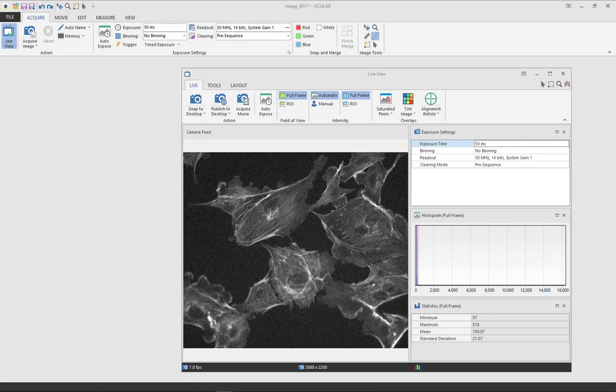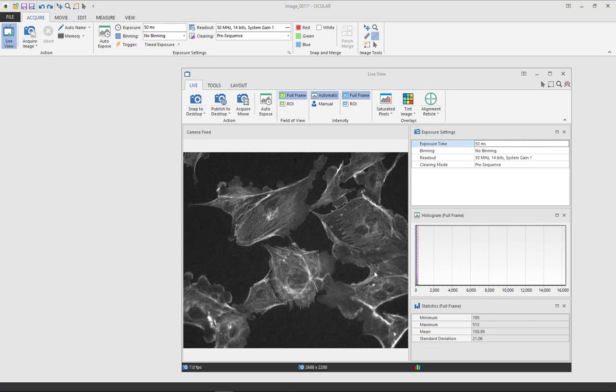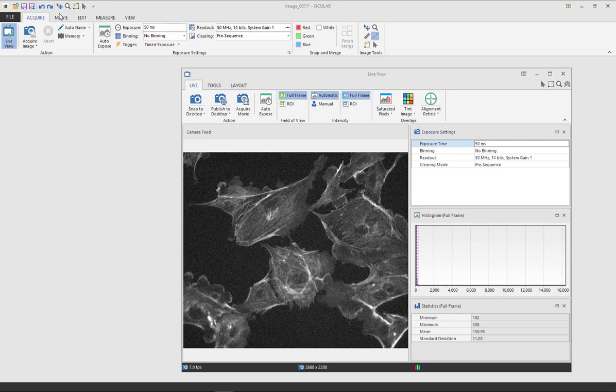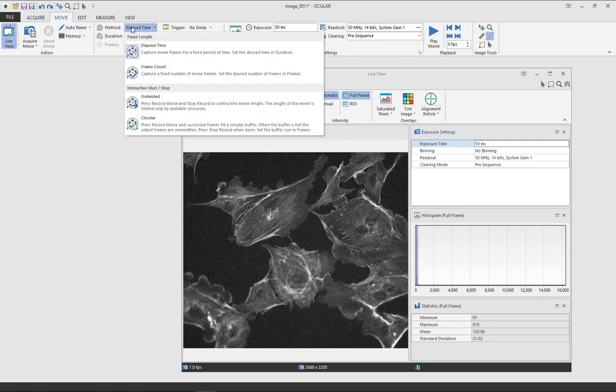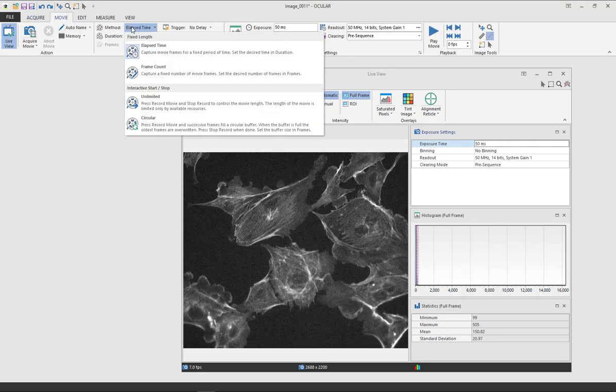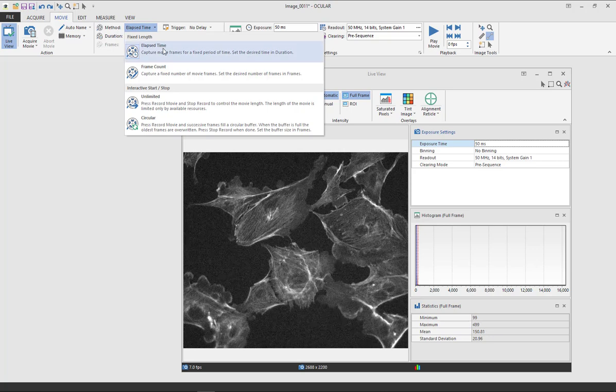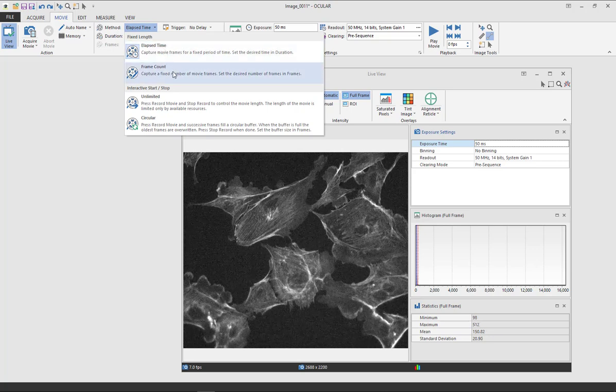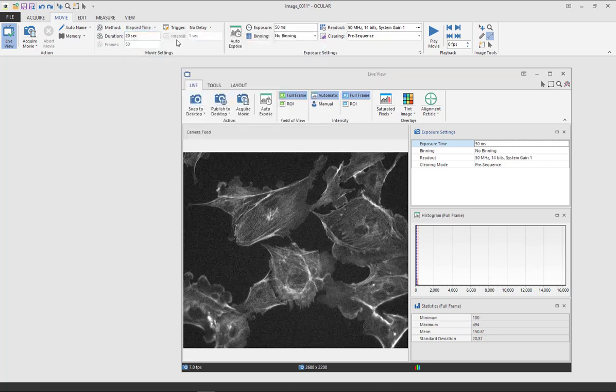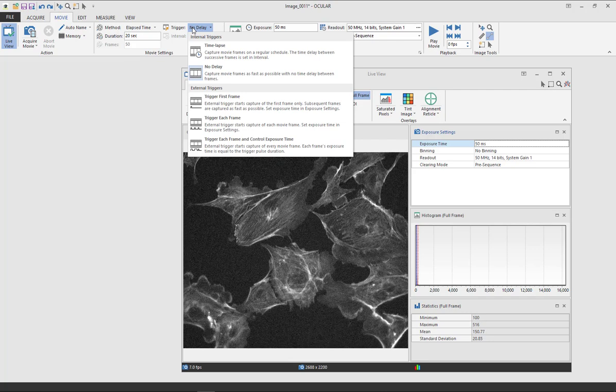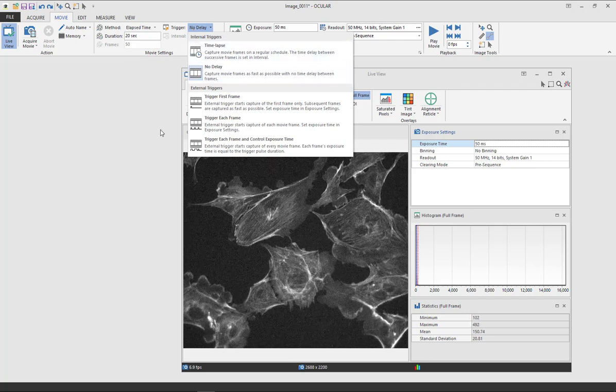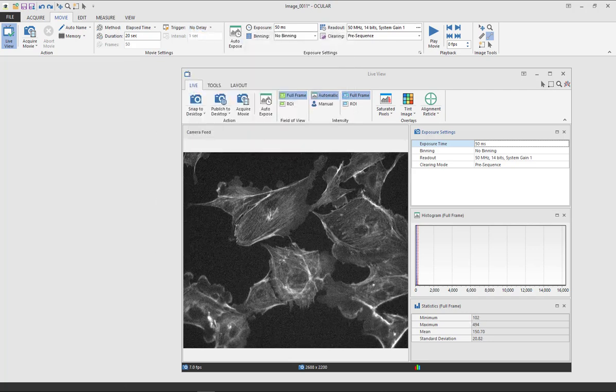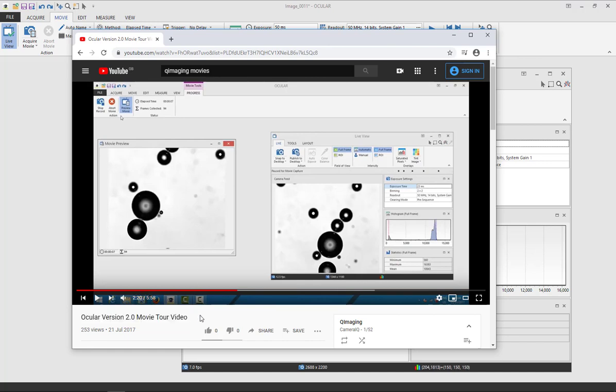Ocular will allow you to capture short movies using the movies tab. You can set the length of your movie here and whether you want to capture your movie for a fixed period of time or by a fixed number of frames. Triggering for each frame can be set here, and on our YouTube page there is a video which goes through all the types of movies that you can capture in Ocular.